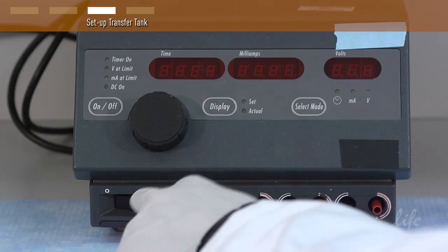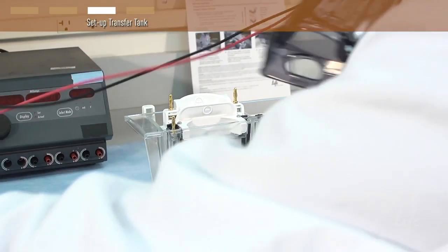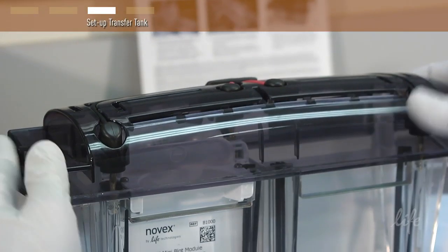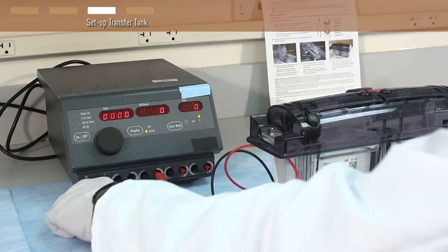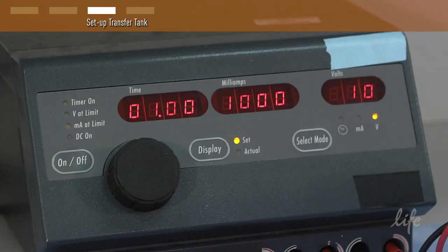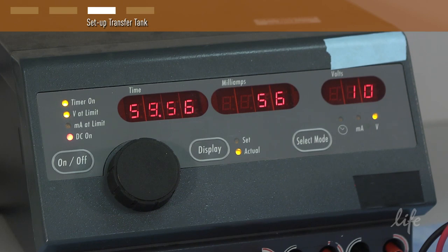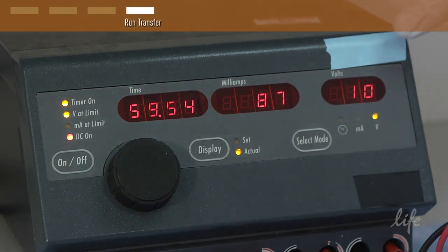Make sure the power supply is off. Place the cover on the tank and plug the power leads into the power supply. Turn the power supply on to begin the transfer. Transfer for 60 minutes at a constant 10 volts for nitrocellulose membranes and at 20 volts for PVDF membranes.